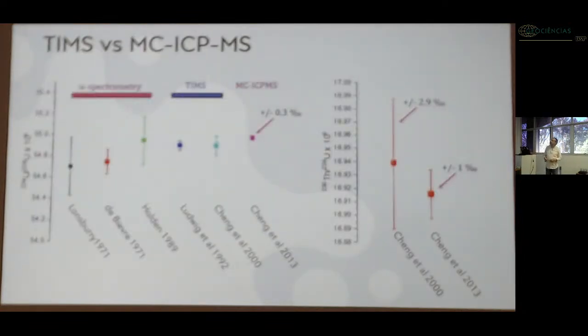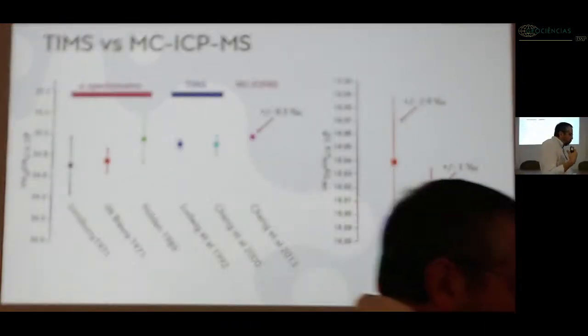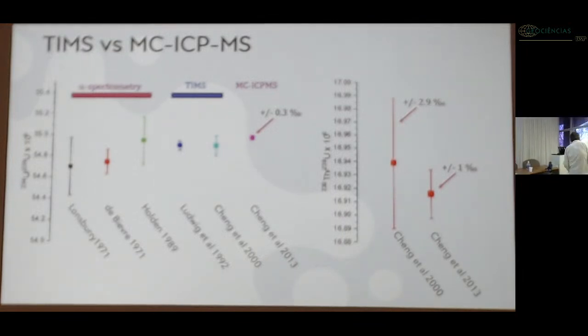So, a small comparison. These are the half-lives. This data is from different papers. I'm comparing the uranium-234 to 238 values at secular equilibrium, from which the half-lives were deduced. Basically, these 3 measurements were obtained with alpha spectrometry. So you see, in the most ideal conditions, these are the precisions that you obtain.